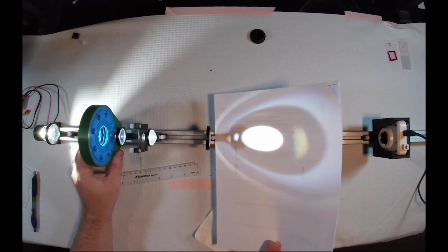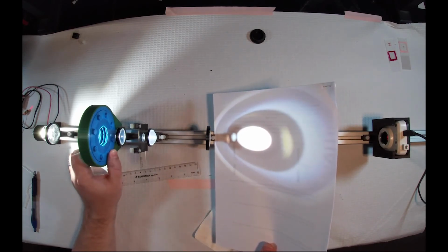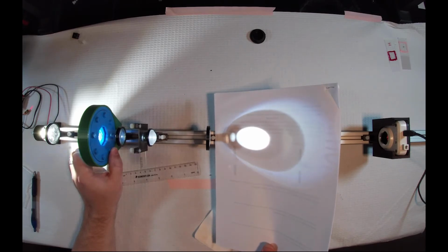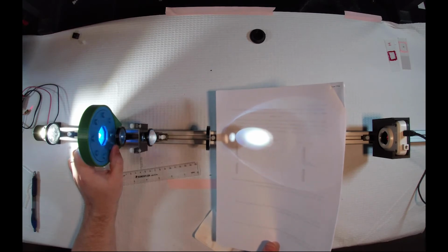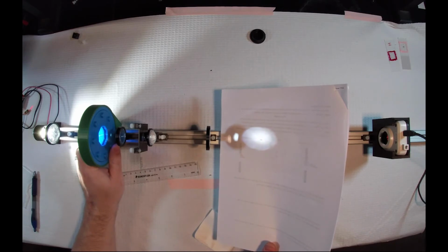Just going to open that up. So as I close down my iris, you can see that you don't see an image of the teeth appear as you did before. You just see a dimming of that light. And then a pattern should emerge that you might recognize. And this is the LED.